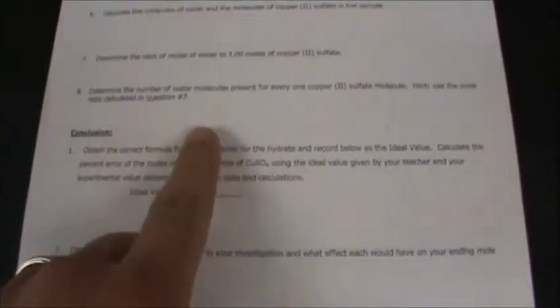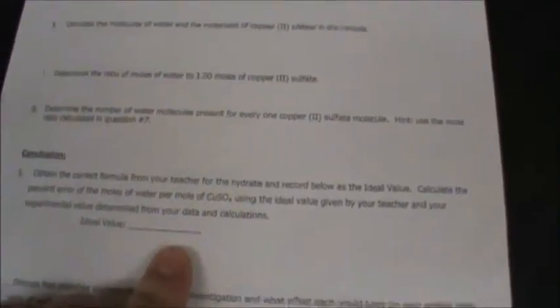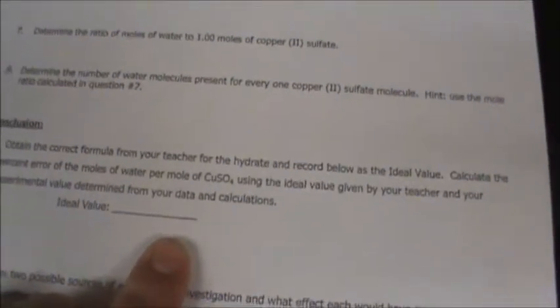It's always surrounded by a certain number of water molecules. You need to determine that number of water molecules that comes from question number 8. The value that you will fill in here, like it says right here, your instructor will tell you this value. It is 5. I'm telling you it right now. The copper sulfate should be a pentahydrate.